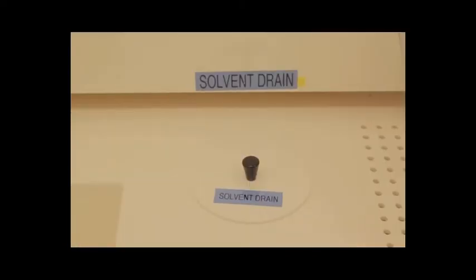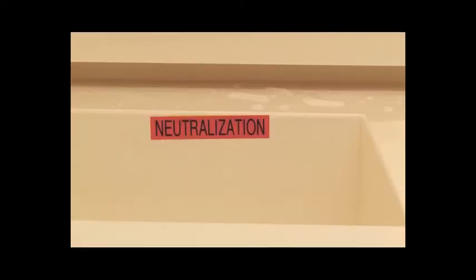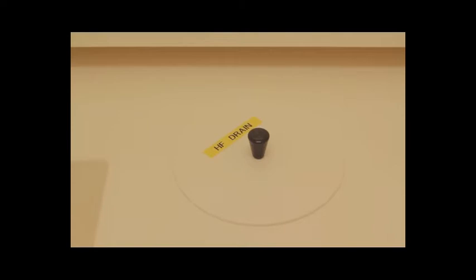There are five different types of chemical drains in Micronova. These are called solvent, neutralisation, HF, posistrip and resist waste. Drains are always labelled.